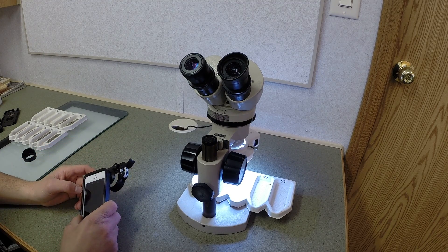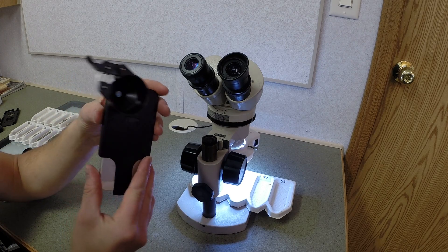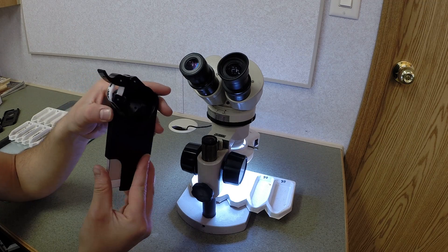Hey guys, Gorth Belling here. So I was browsing through some Kickstarter projects and I found this. It's called Magnify. It's from Arcturus Labs.